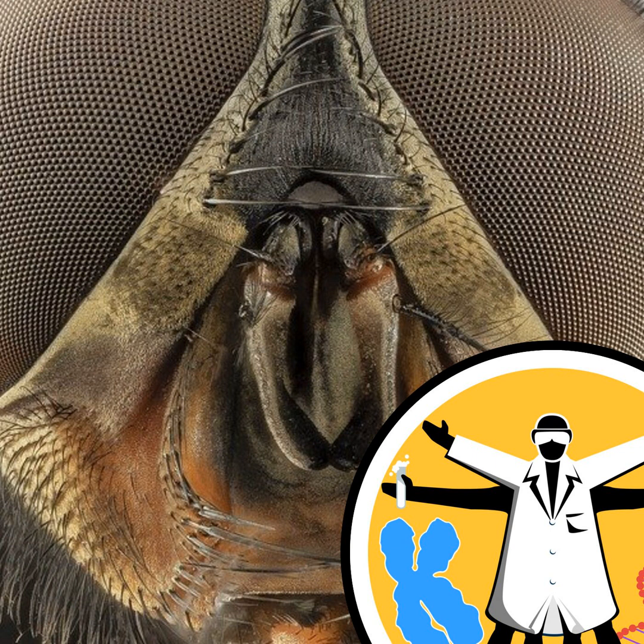This is the bit where it gets a bit experimental, because we don't really know how long we're going to have to leave them in there so we don't dissolve too much fly, but we do still collect everything that's on the outside of them.